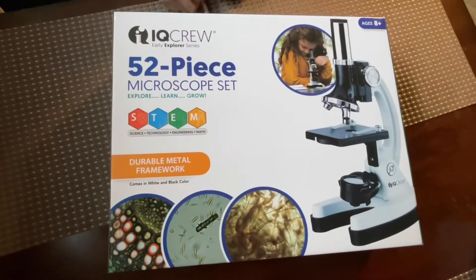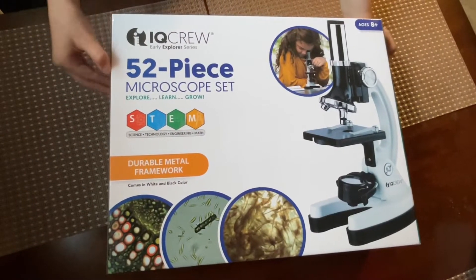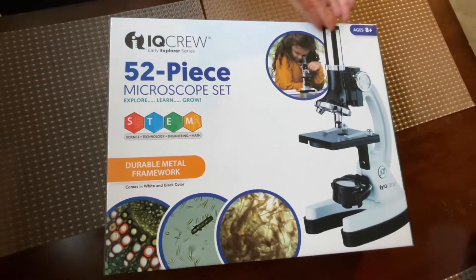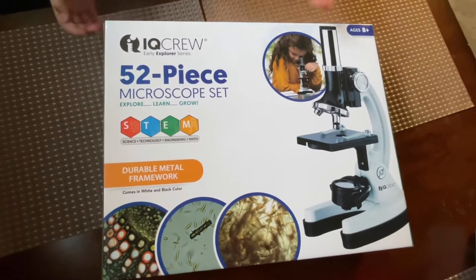Hey guys, this is Lisa. Today I want to share with you the new microscope my parents got for me. So this has 52 pieces and it's for ages 8 plus. So let's open it up.